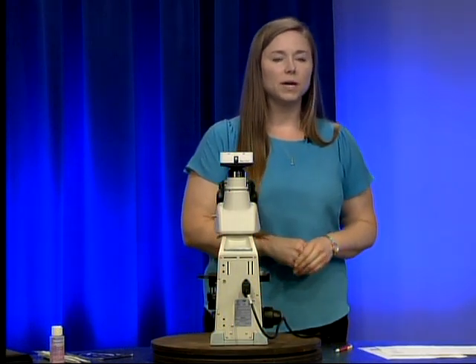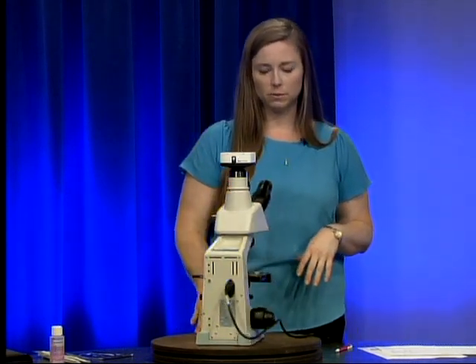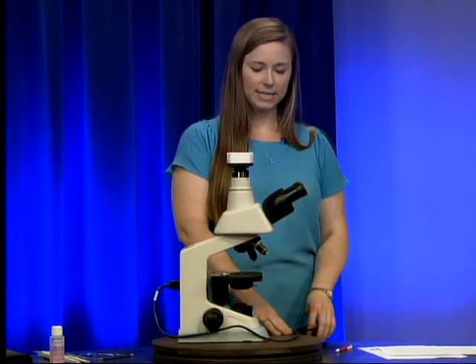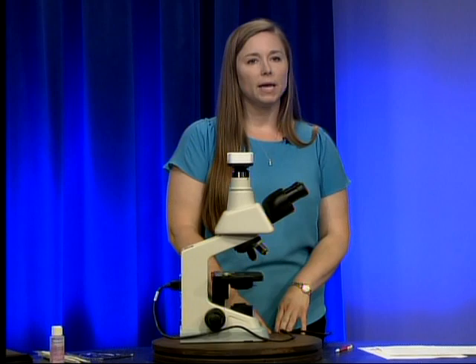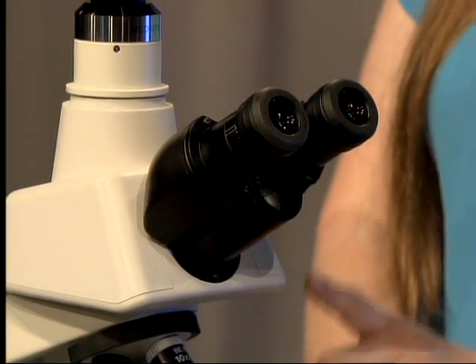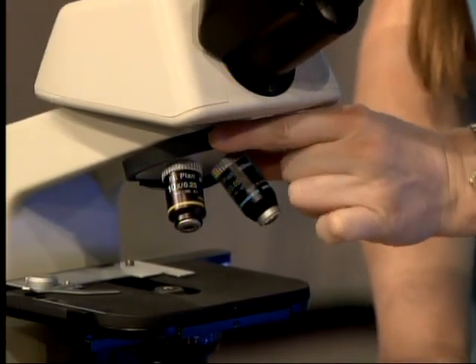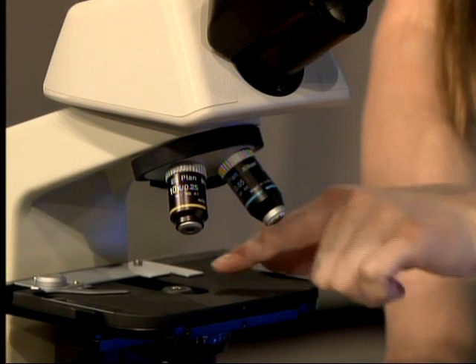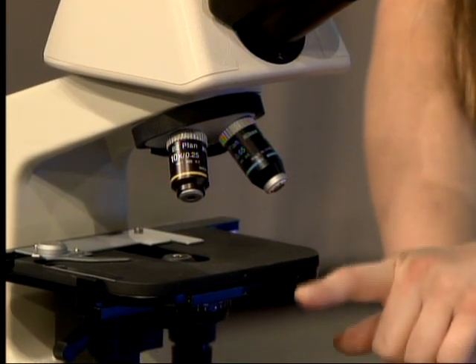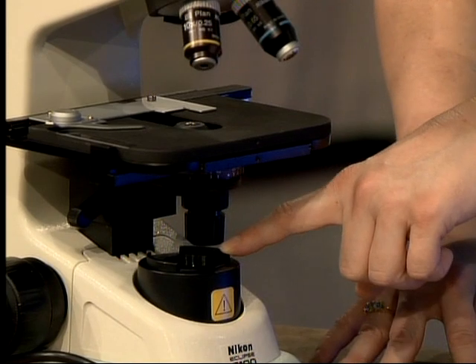The first thing we're going to cover for daily maintenance is cleaning the optical surfaces of our microscope. The optical surfaces are any of the glass lenses, and of those we have the eyepieces, also known as the oculars, the objectives — of which there are two on this microscope — the condenser, whose lens you can see through the top of the stage, and the field lens where the light source comes from.